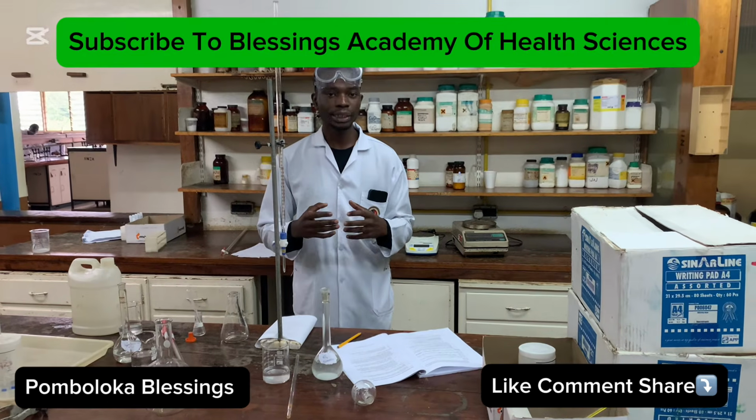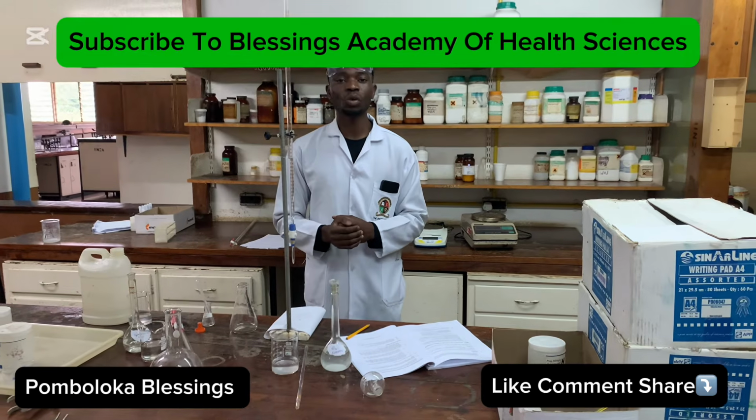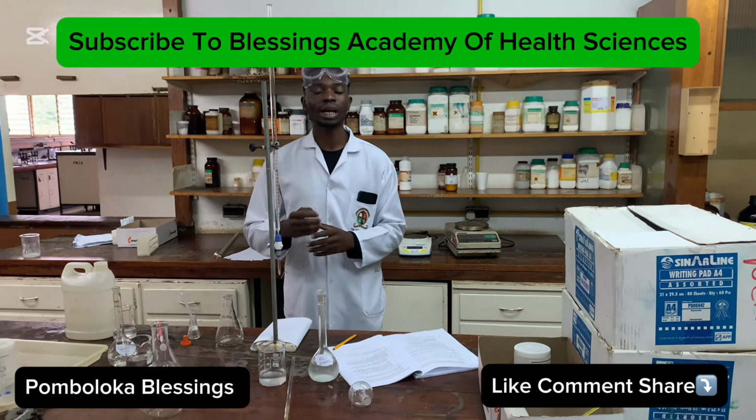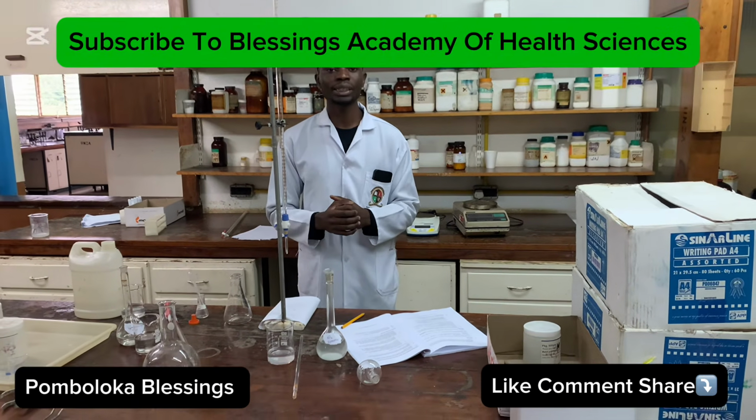Just make sure that when you're working out this lab report and doing those calculations, you consider back titration, because you're working from the second part of the reaction and going back to the first part of the reaction, finding out the exact moles and the masses that we're reacting.